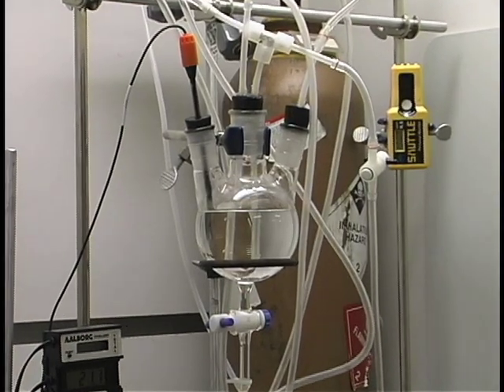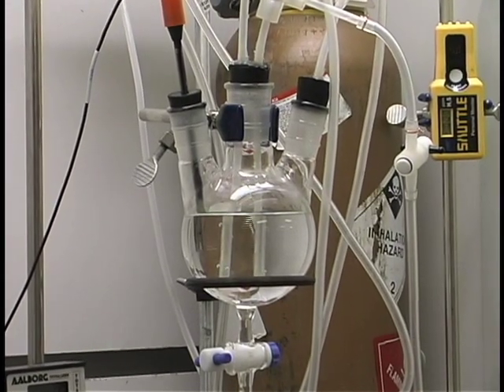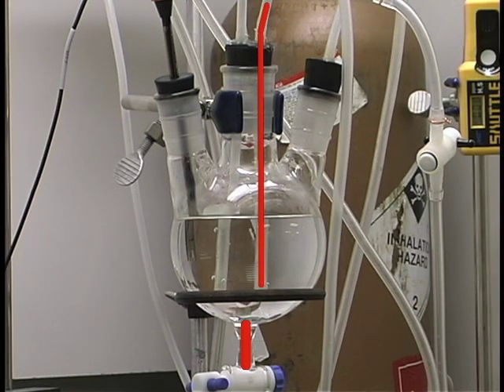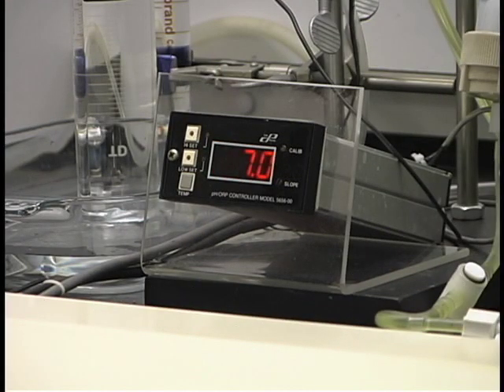Our scrubber vessel consists of a glass round bottom flask fitted with multiple ports to accommodate H2S inflow, scrubber solution outflow, and sulfide solution returning from the photoreactor. It also has ports for a pH monitoring electrode and a pressure relief valve. Initially, the vessel contents, consisting only of scrubbed bisulfide ion, are clear in color. This is the pH monitor, which tells the H2S solenoid when to supply more gas to the scrubber. In this scene, the monitor has been set to pH 7.